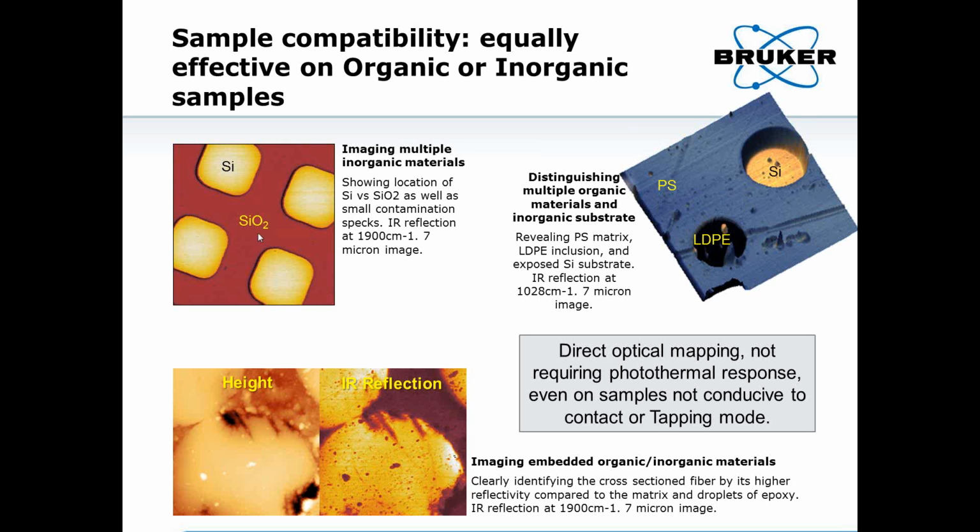So relatively stiff materials such as silicon and silicon dioxide on silicon can be measured with this technique, and even a cross-section of an optical fiber can be measured with very fine details visible in the infrared reflection channel.